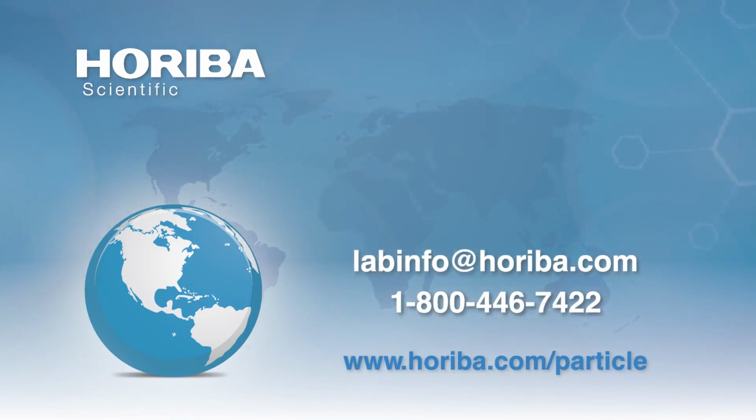Got it. Very cool. So we got quite a bit of questions that came in. What is the ideal solvent for the zeta potential measurement? Is it 0.9% saline? Well, okay. There is no ideal liquid. It's the liquid that you need in order to make your product.